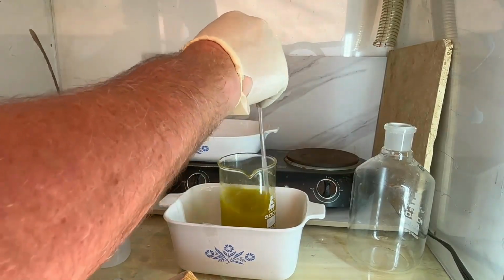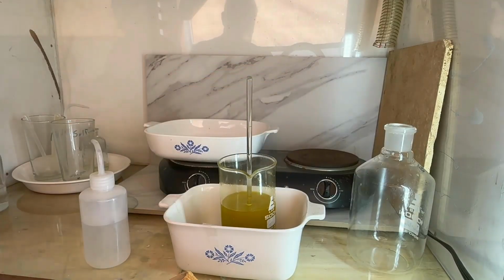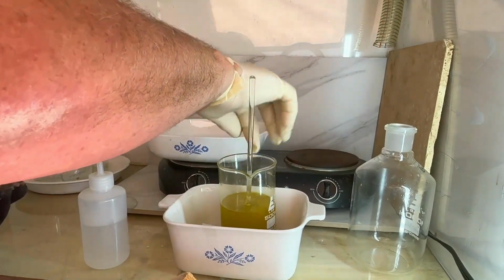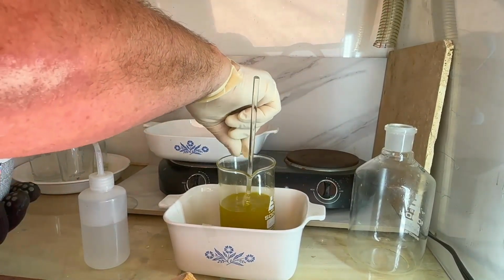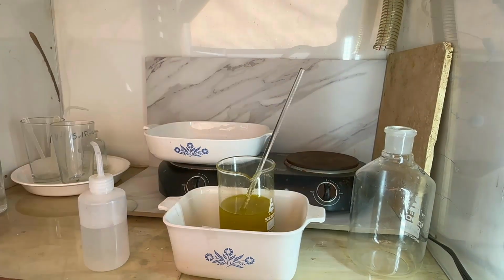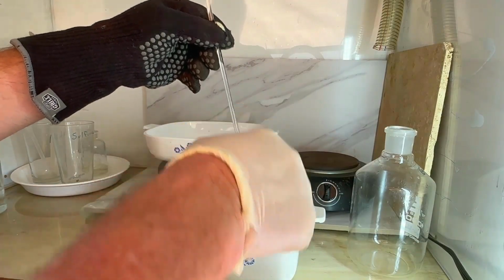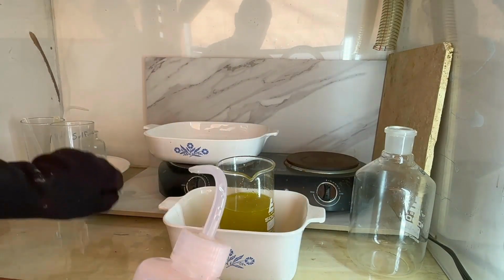The other nice thing about adding sulfamic is that it also produces sulfuric acid when it reacts with the Aqua Regia. This is going to essentially result in dropping out any lead out of our solution, so that it also filters out without having to actually add sulfuric acid. All right, it's looking pretty good. I think it's time to move on to filtering.